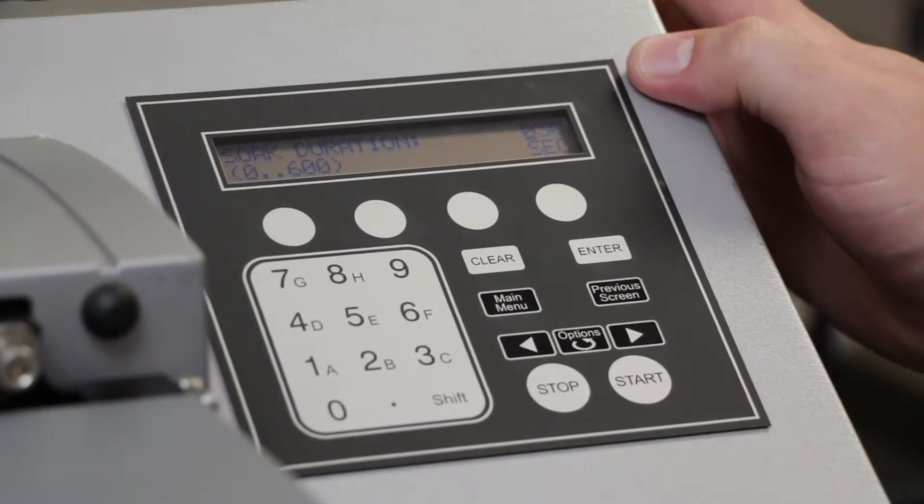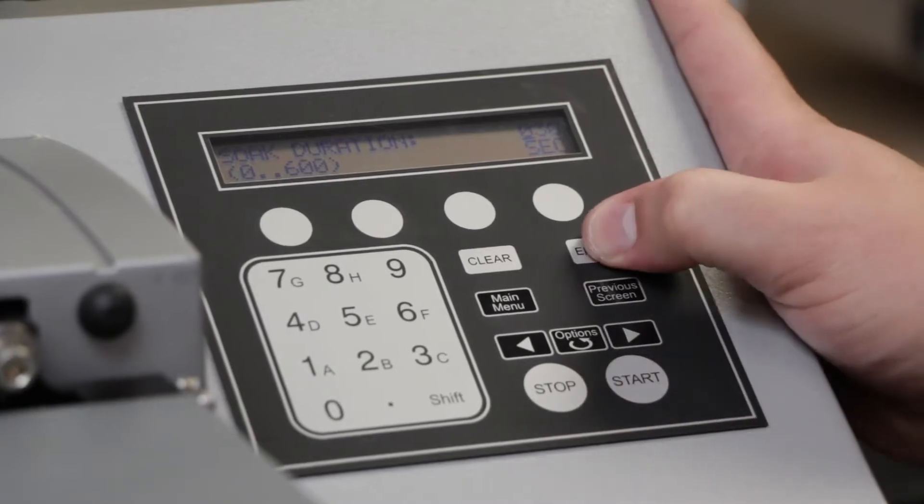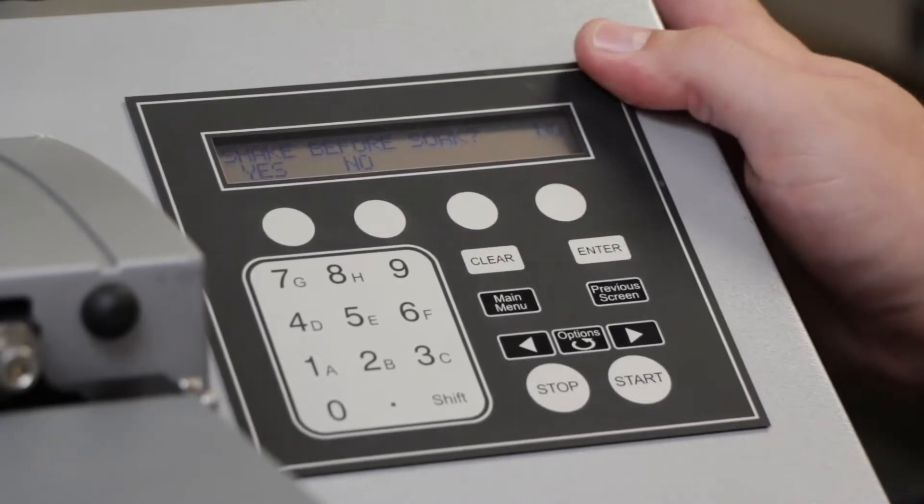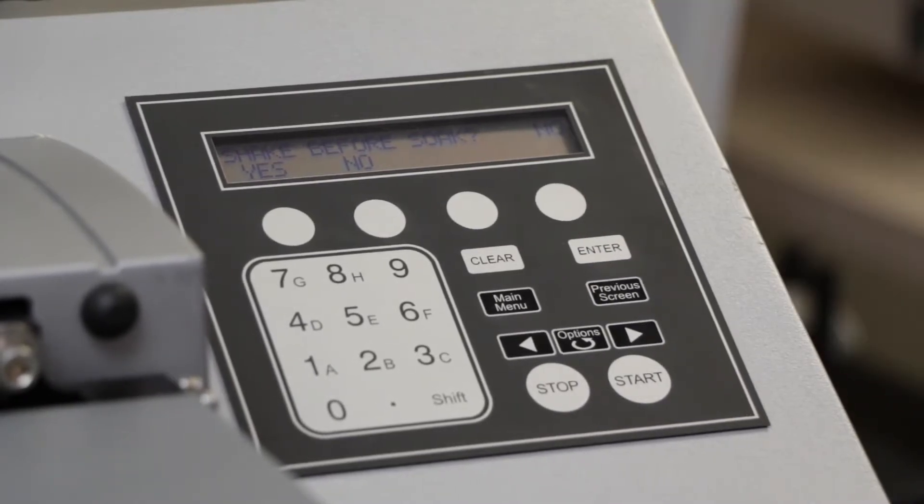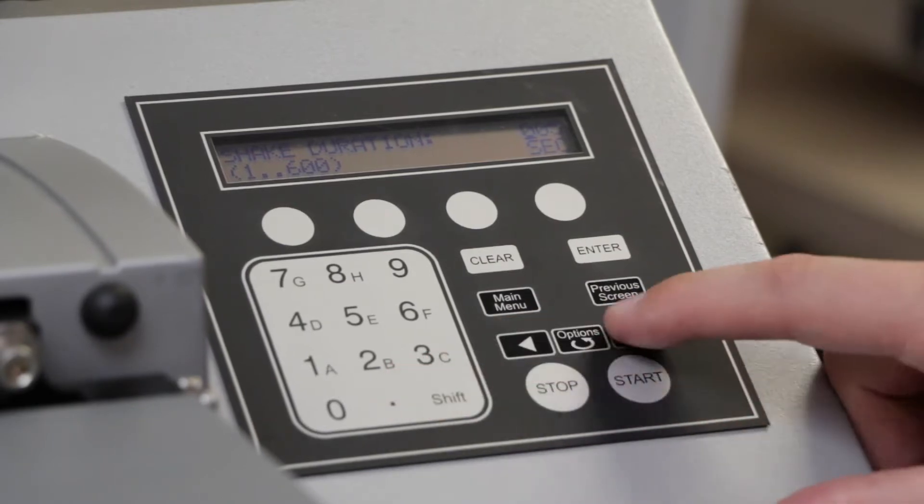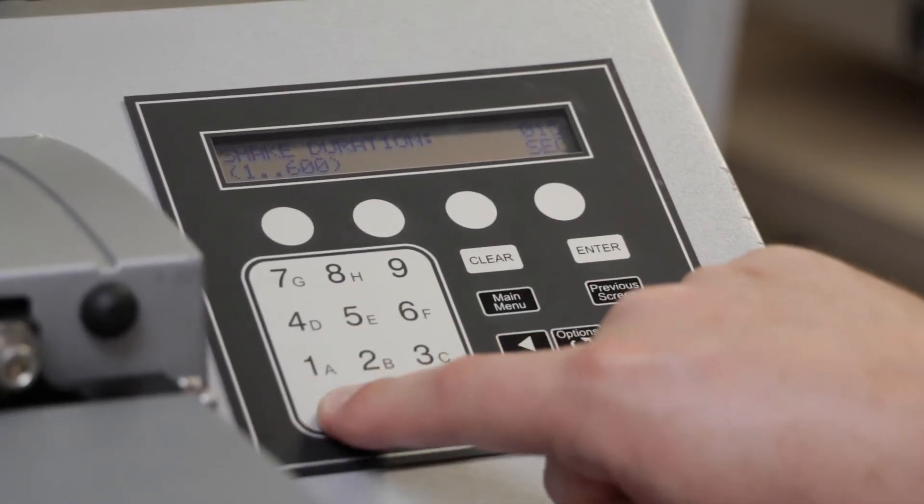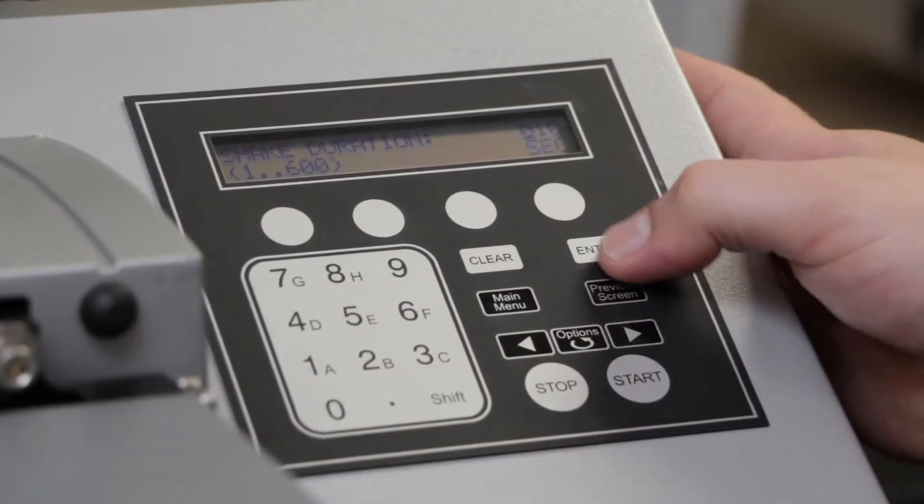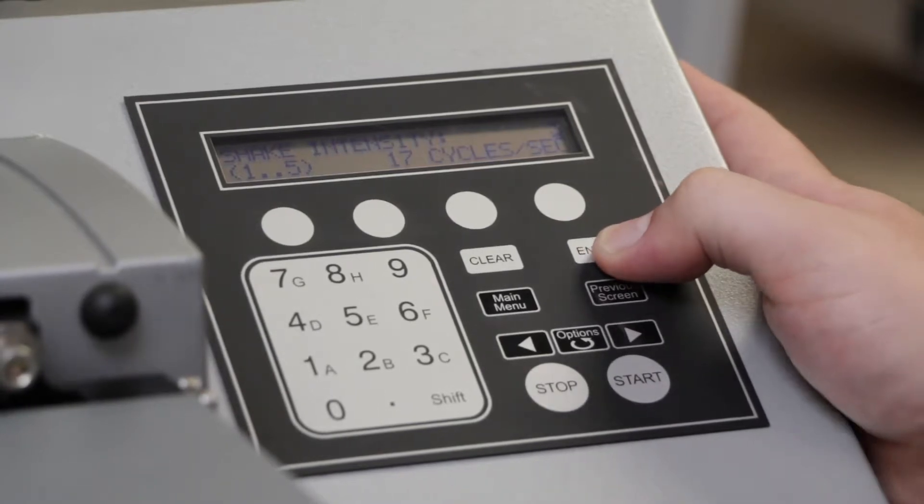For soak duration, we'll leave this at 30 seconds, but it can be anything from zero to 600 seconds. Shake before soak will cause the carrier to shake and help loosen up anything built up in the plate. We'll select Yes again. Set our shake duration, in this case 10 seconds, simply by entering on the keypad, pressing Enter to confirm, just like the other steps.